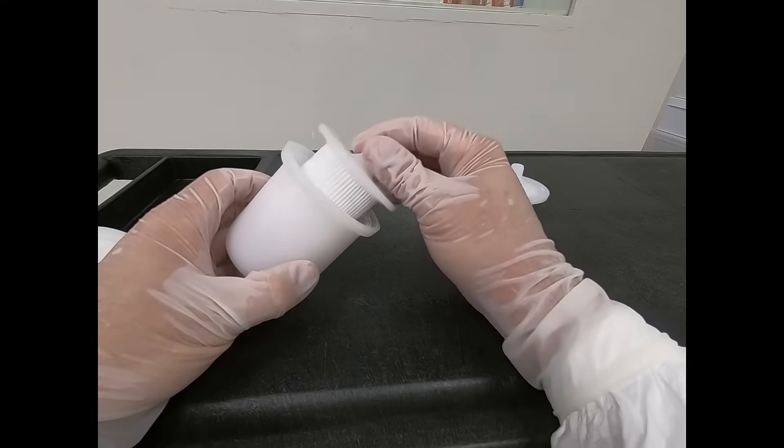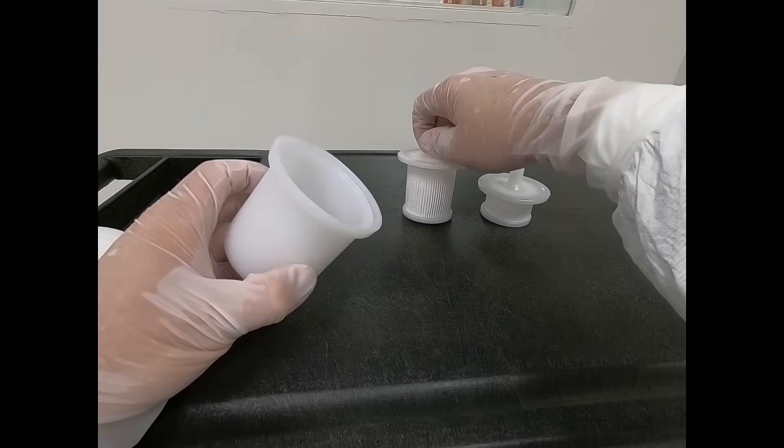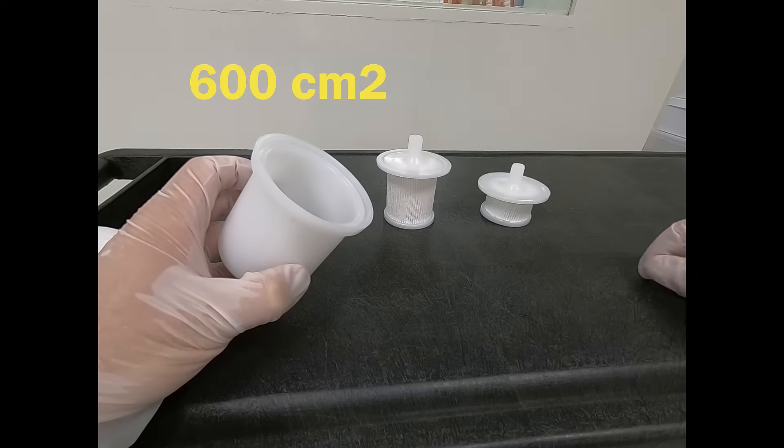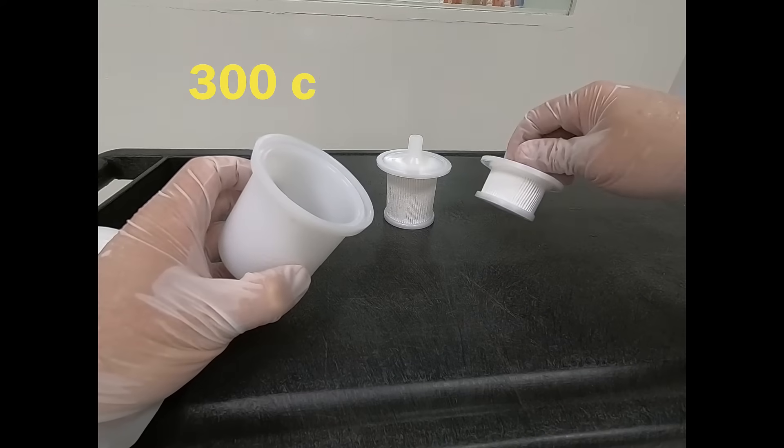Watera filters are produced in two sizes. We make a high capacity filter with 600 square centimeters of media and a medium capacity filter with 300 square centimeters.